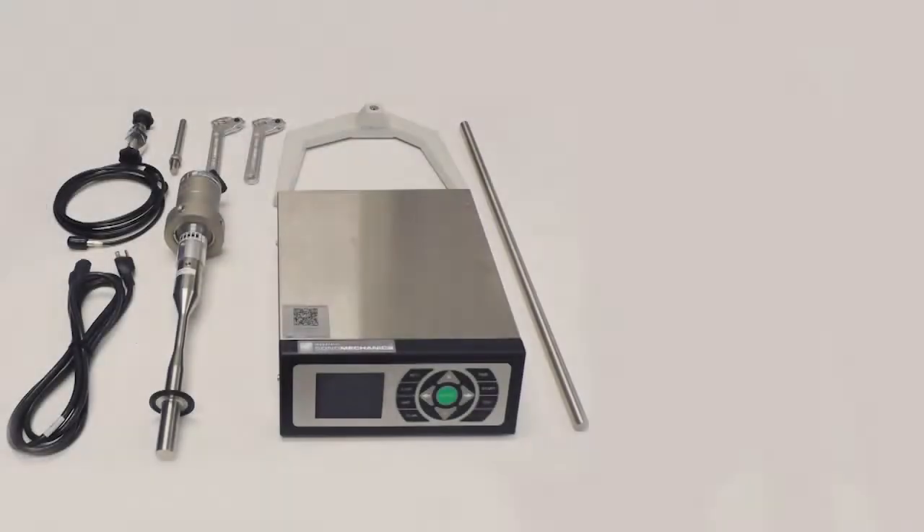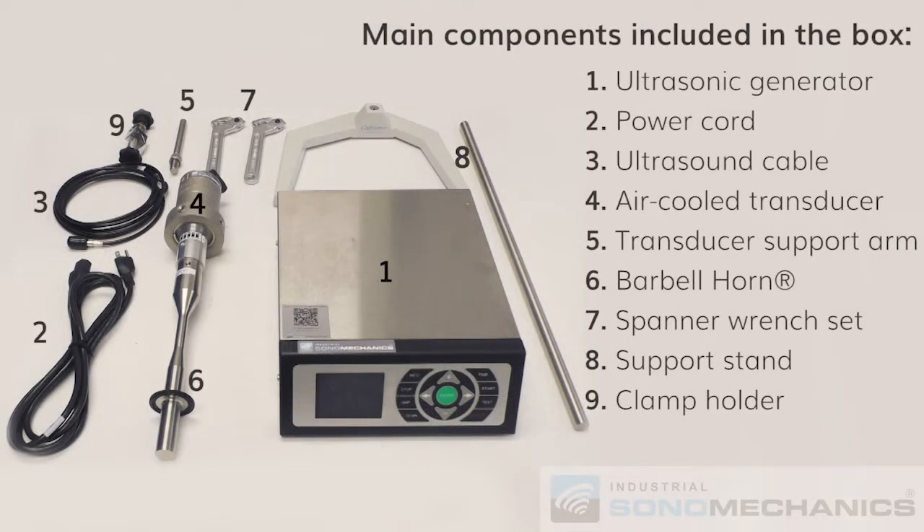The included main components of the system are: ultrasonic generator, power cord, ultrasound cable, air cool transducer, transducer support arm, FBH type barbell horn, spanner wrench set, support stand and clamp holder.